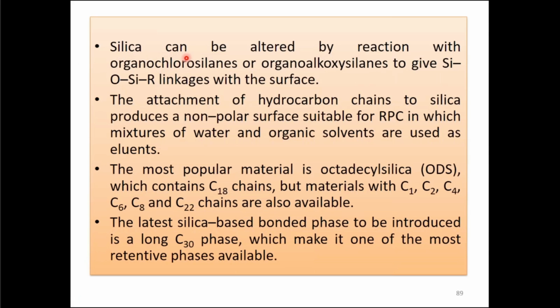So silica can be altered by reaction with organochlorosilane or organoalkoxysilane to give SiOH, as it was earlier. Now after reacting with this, it becomes SiO-SiR linkages with the surface. So what does R stand for? For some organic group.